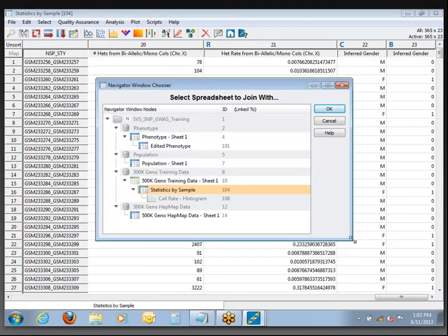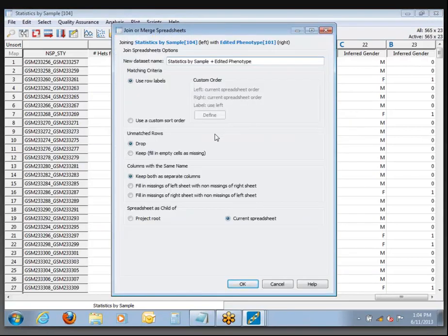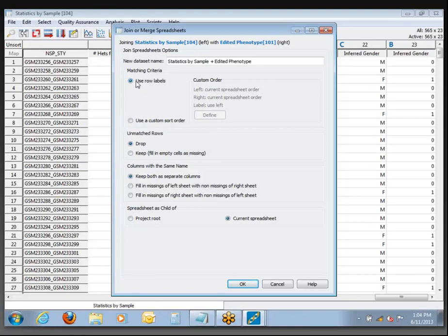Select the sheet you want to join with — in this case the edited phenotype we made — and click OK. The most important options: matching criteria — are you matching based on row labels or some other criteria? It's always easiest to join based on row labels. Then you choose what to do with unmatched rows — there shouldn't be any this time, but you can either drop the ones not present in both sheets or keep them.